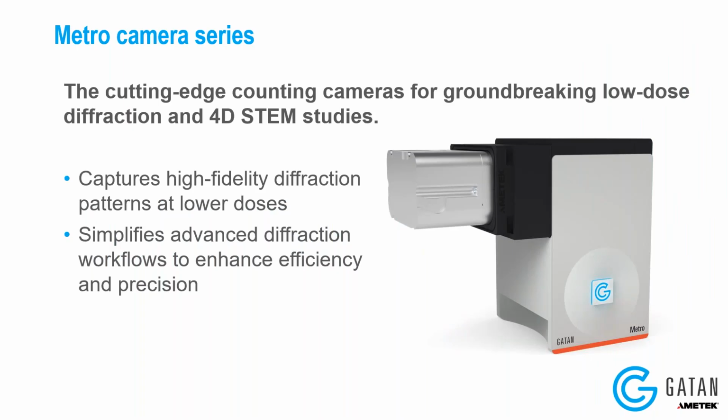And then I'll talk about how the Metro cameras really simplify some advanced diffraction workflows, whether that's 4D STEM or continuously acquiring in-situ data, diffraction videos, or even just being able to look at a diffraction pattern without extensive setup.